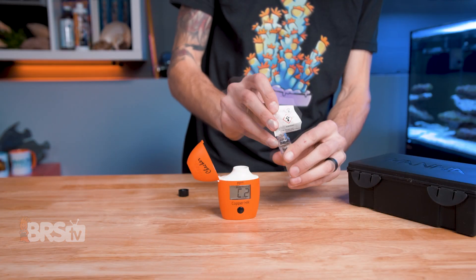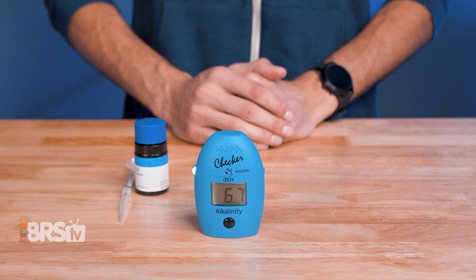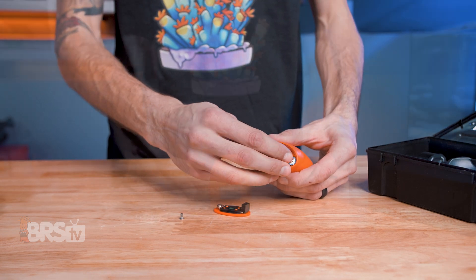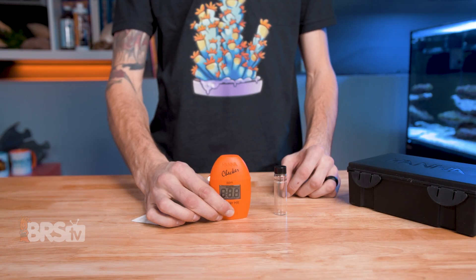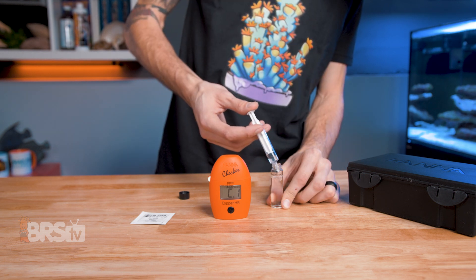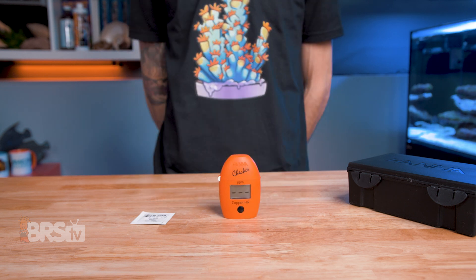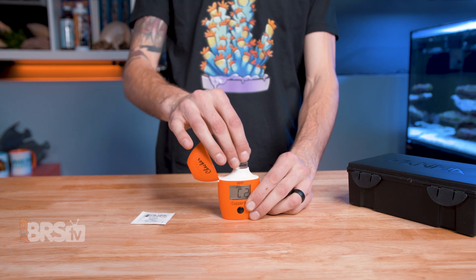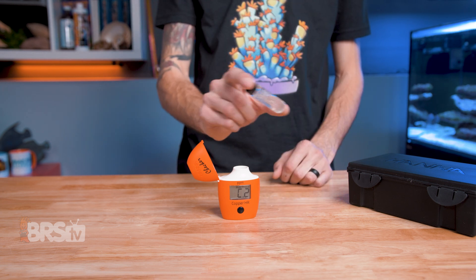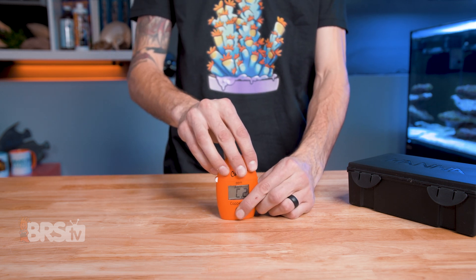It only takes a single pre-measured reagent and a couple of minutes to get your copper reading, and if you've been a fan of Hanna's alkalinity checker, you will feel right at home using this one. To perform a test with your brand new checker, the first thing you'll do is install the battery. Next, turn the checker on by holding the button and wait for C1 to be displayed. Next, fill a cuvette with water from your aquarium up to the 10 milliliter line and cap it. Place it into the checker, close the cap all the way, and press the button. Once it displays C2, remove the cuvette, take off the cap, add one full packet of reagent to the cuvette, replace the cap and gently shake it for 15 seconds to mix it. Place the cuvette back into the checker and close the cap all the way, then press and hold the button to start the 45 second timer.